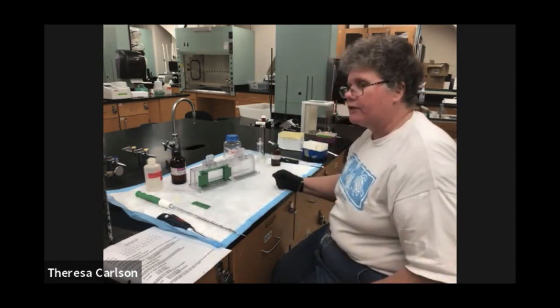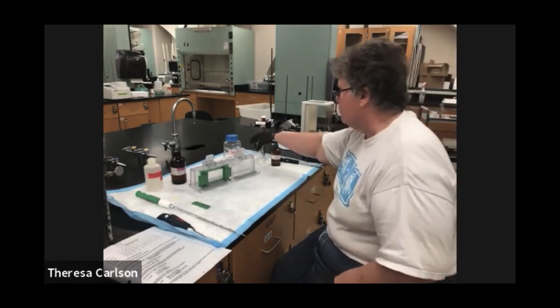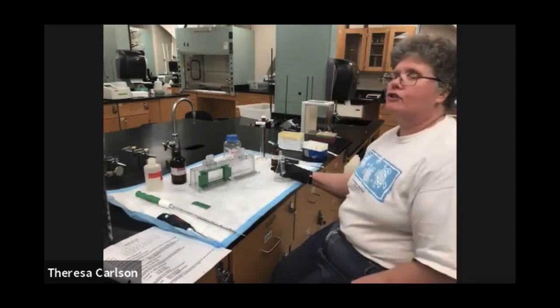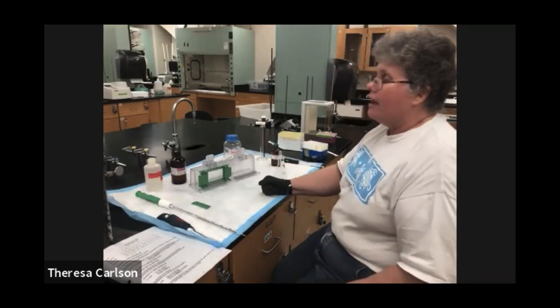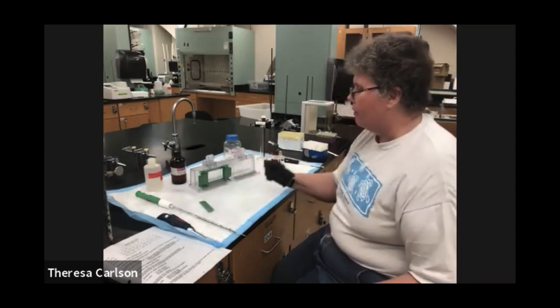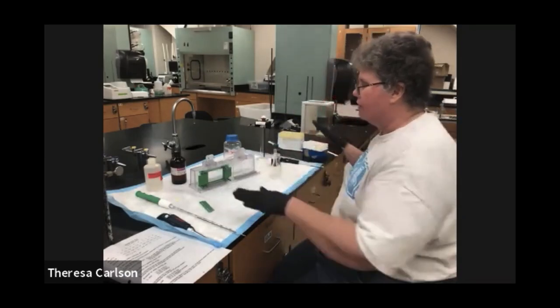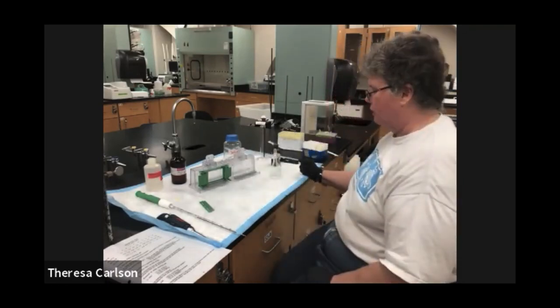and you want to make sure you're ready to go when you are pouring this in. The worst thing in the world you can do is have your acrylamide solution all ready, you add the APS, you add the TEMED, you swirl, you go around, you talk to your friends for a while, and you go, oh, I guess I better set up my plates, and oh, I guess I better do my comb in there and mark it off. Meanwhile, this is starting to polymerize. So you need to make sure you have everything set up around you to do this before the point at which you need to do it.